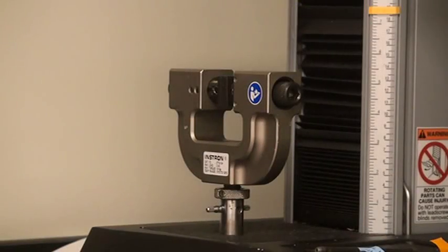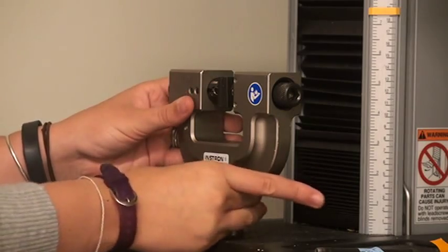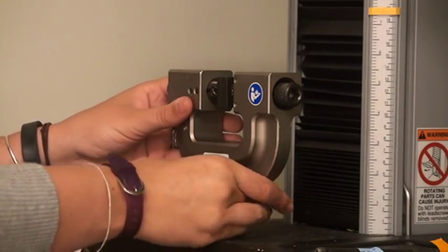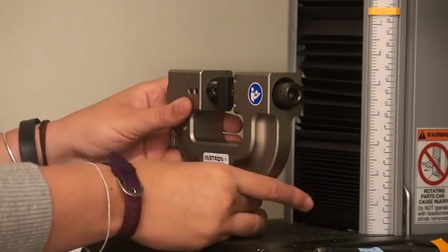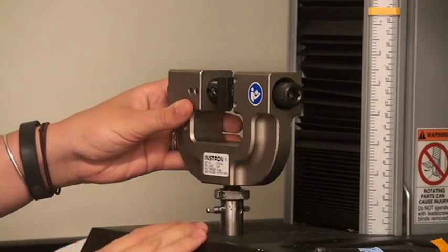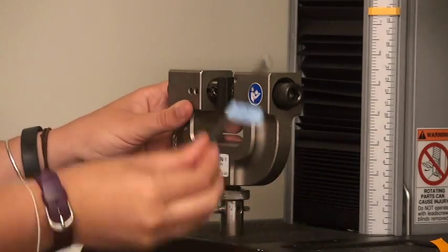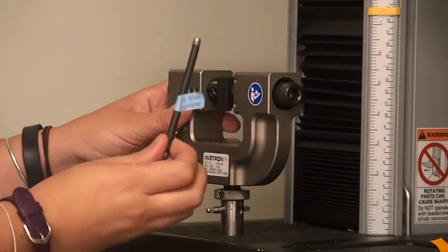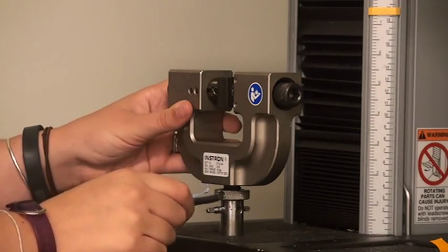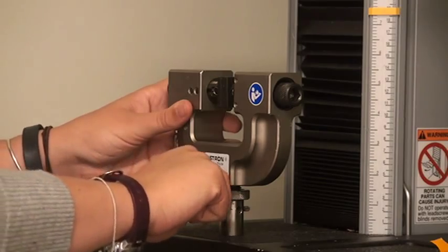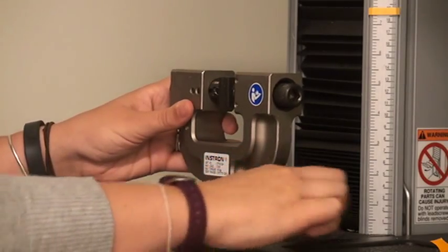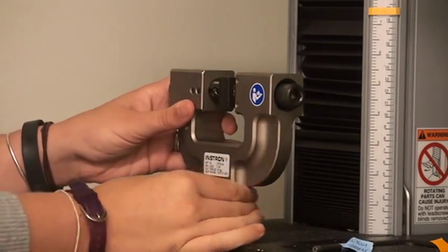To remove the screw action grips, loosen the lock nut on the lower grip by unscrewing it in the counterclockwise direction so that it moves away from the lower collet. If the lock nut is very tight, you can use the lock nut tightening tool to help you unscrew it. Insert the tool into one of the holes on the lock nut and unscrew until the lock nut is flush against the bottom face of the grip.